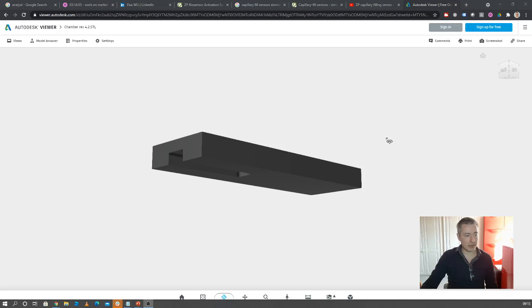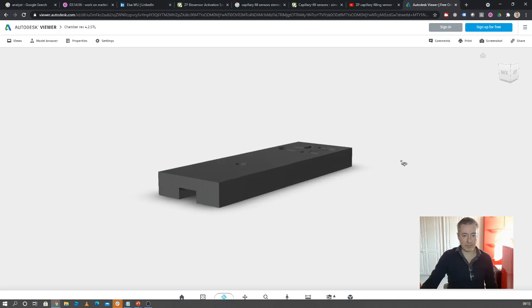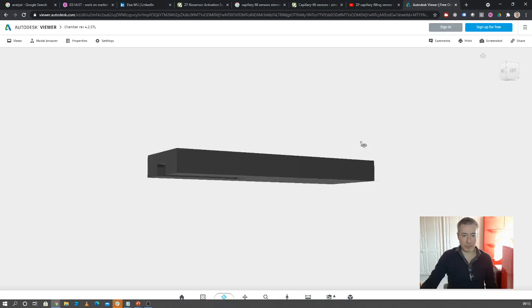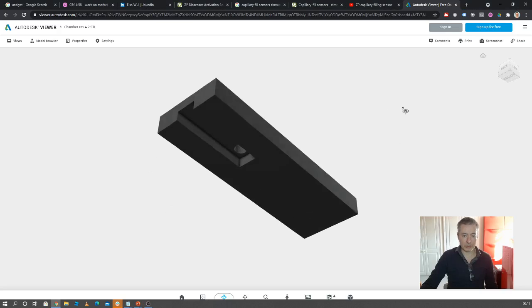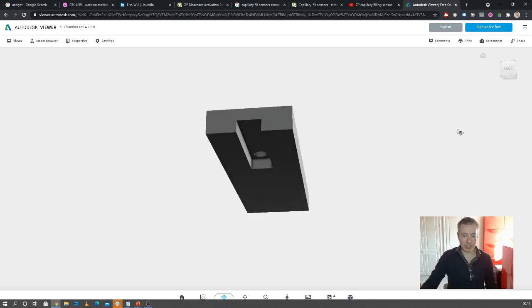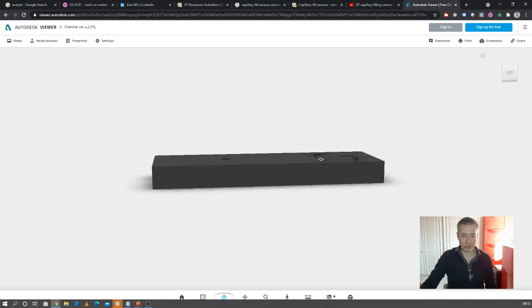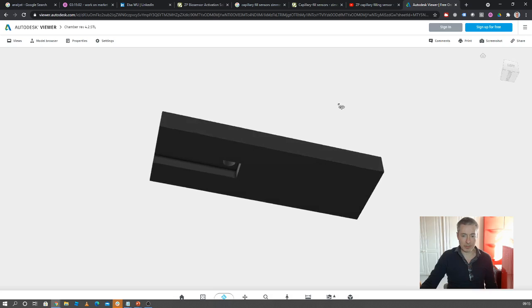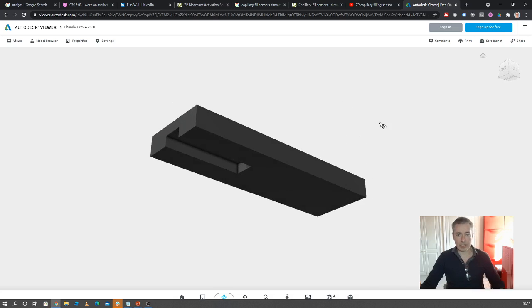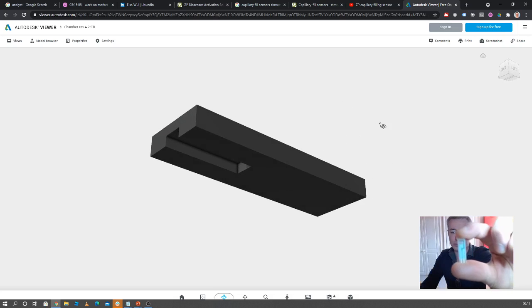Hi, so this is a 3D file that we're putting up onto the developer zone and essentially what it allows you to do is take things like screen printer electrodes like this.